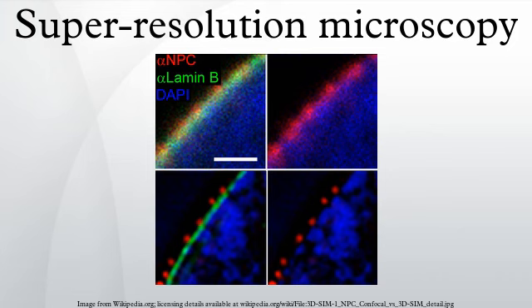SI enhances spatial resolution by collecting information from frequency space outside the observable region. This process is done in reciprocal space. The Fourier transform of an SI image contains superimposed additional information from different areas of reciprocal space. With several frames with the illumination shifted by some phase, it is possible to computationally separate and reconstruct the FT image, which has much more resolution information. The reverse FT returns the reconstructed image to a super-resolution image. Images of cell nuclei and mitotic stages recorded with 3D SIM microscopy.